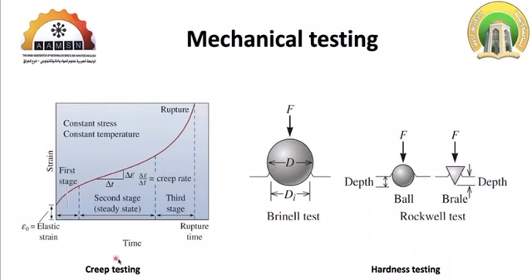Furthermore, creep can be tested, and creep simply is subjecting the material to a particular load at elevated temperature, and then the outcome is the three stages of creep, and we define if the material is time dependent or time independent in behavior.